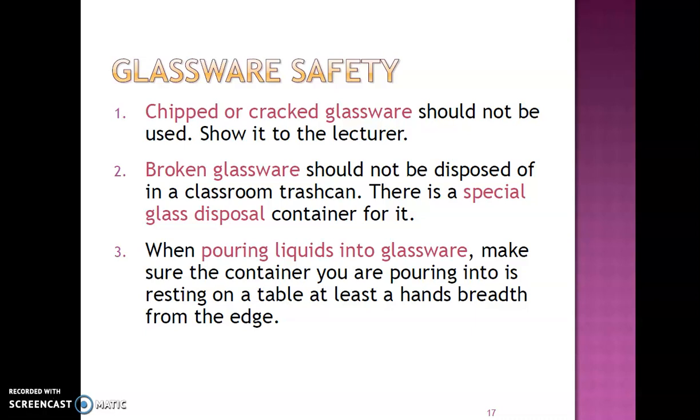Glassware safety. First, chipped or cracked glassware should not be used. Show it to the lecturer. Broken glassware should not be disposed of in a classroom trash can. There is a special glass disposal container for it.